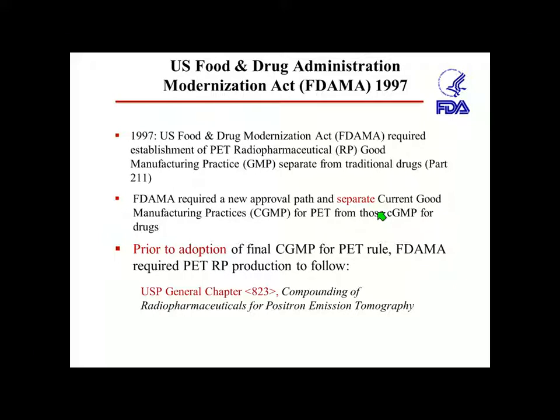Therapeutic drugs, they might want, say, 10 injections of a drug after you make it before you could release it. Well, each one of those injections on HPLC or a GC takes maybe 15, 20 minutes, so we can't do it. So we spent a lot of time getting this regulation, working with the community and with the FDA.